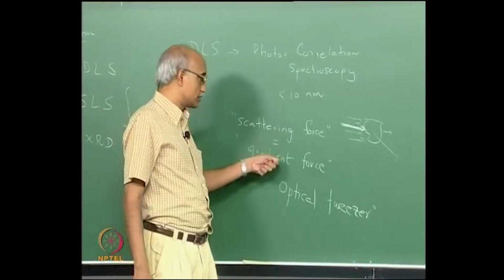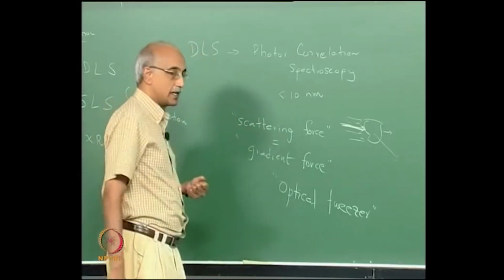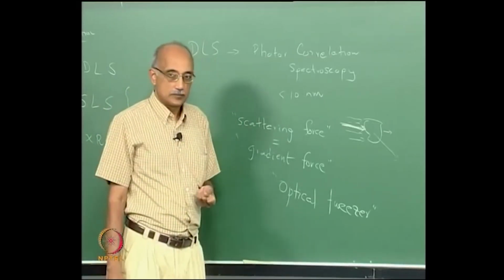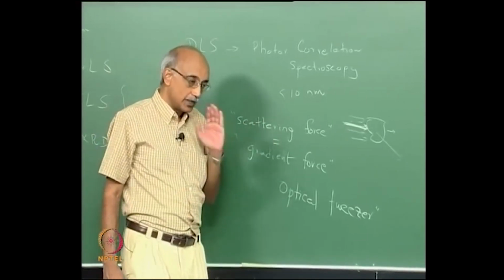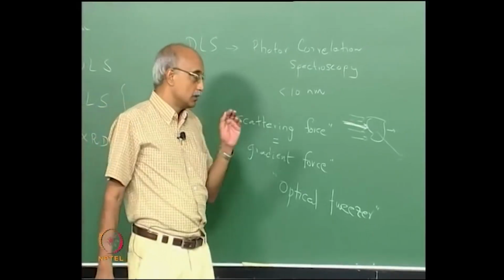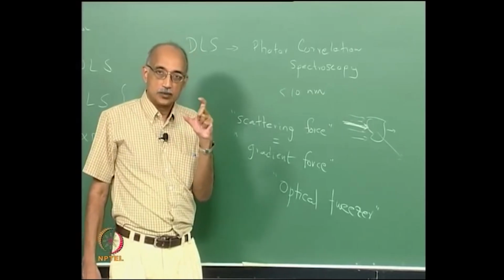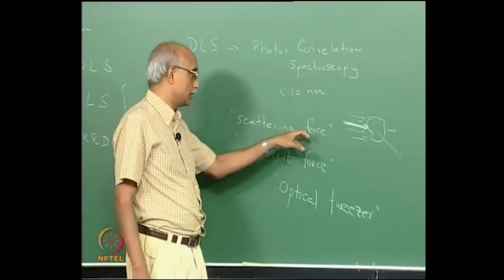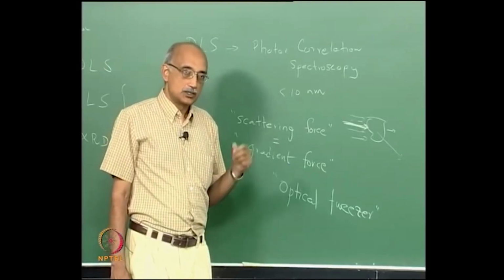So, once you use this and you hold the particle in place, then you can apply your static methods of analysis. Again, what this requires is a well directed and highly focused light beam whose width has to be smaller than that of the particle dimension in order for us to be able to use this gradient force to balance the scattering force.